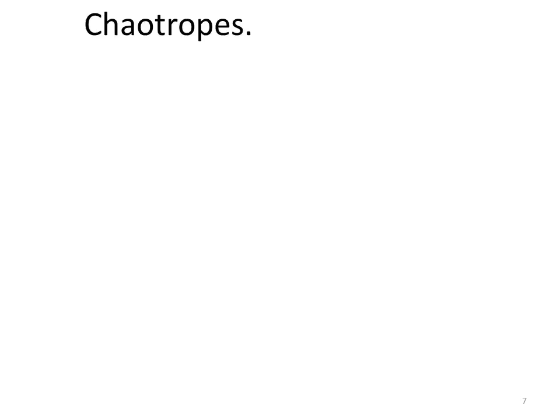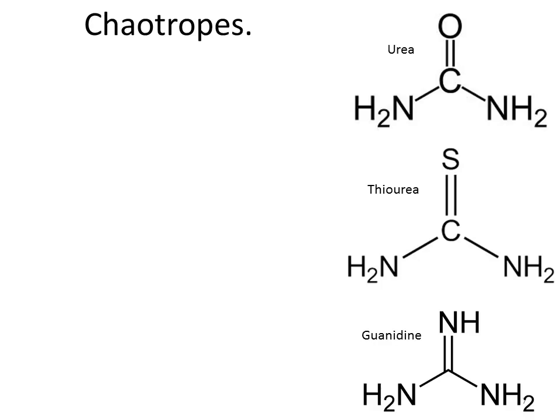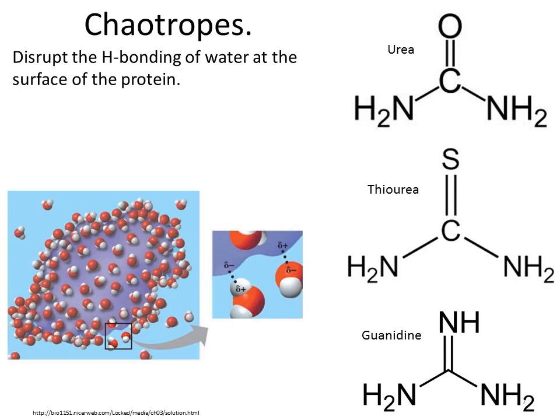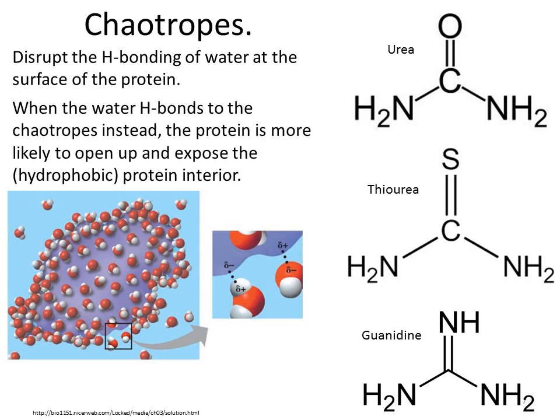These are small molecules that are able to disrupt hydrogen bonding with water and other amino acids to unfold the protein chain to expose hydrophobic regions that can interact with the chaotrope molecules. Thus, the chaotropes can also break apart protein complexes. Chaotropes are usually present in the highest concentration possible without the chaotrope precipitating, up to 8 molar for urea.